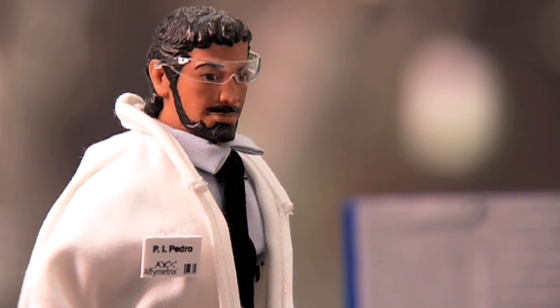Prepare to decode, Geno. Ha ha ha ha ha ha ha ha! Gene Titan!